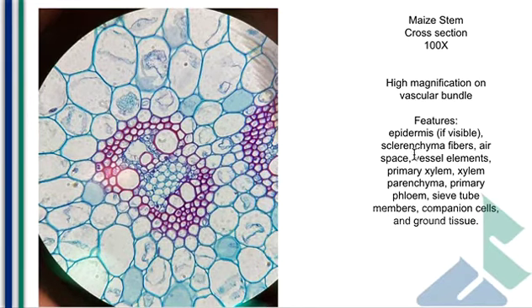But the sclerenchymal fibers are visible by their location distal to our xylem. So we can identify our xylem here, big old vessel elements with the corresponding airspace. This, to many people, can look like eyes and a nose. The sclerenchyma fibers are farther away.